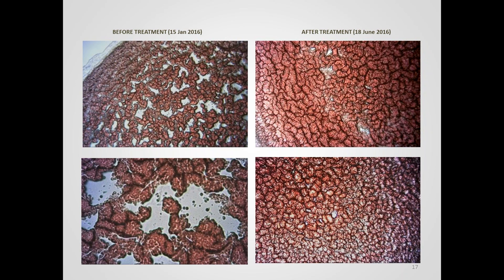Very important to monitor as well, and you can see the improvement taking place there. Going into the lighter areas in that example, we're not really able to see any of these, be it sialic acid or Heinz bodies, within those areas.